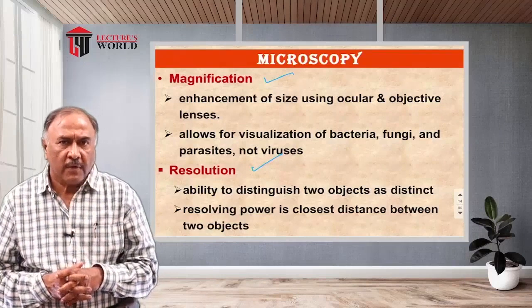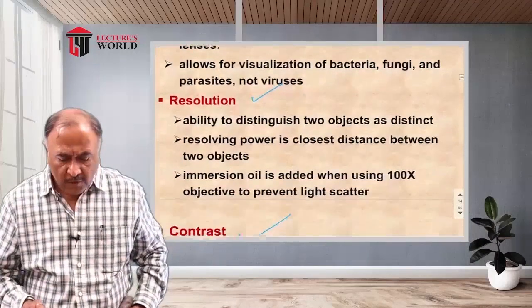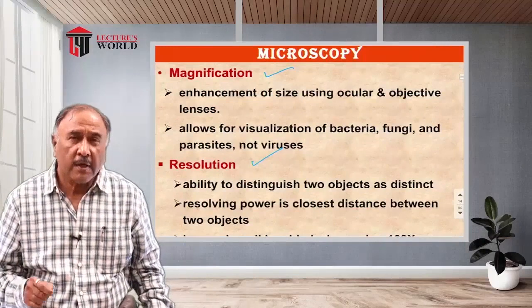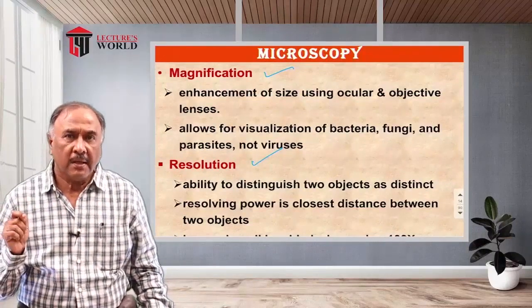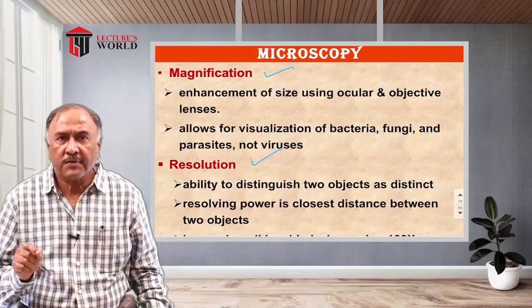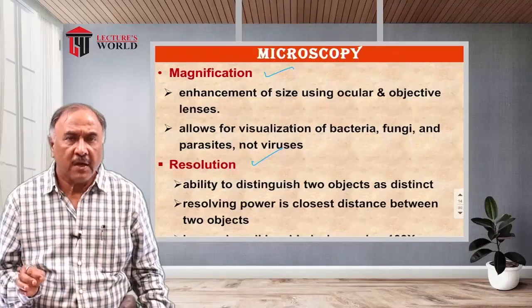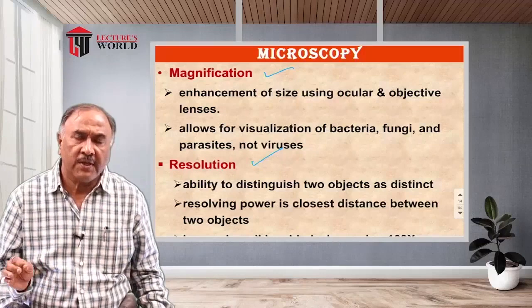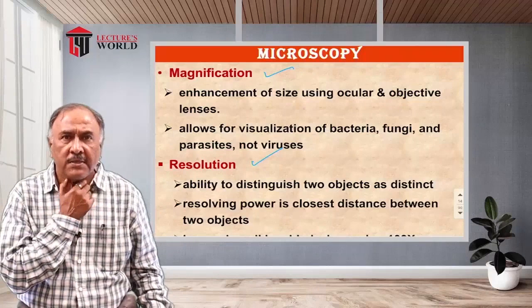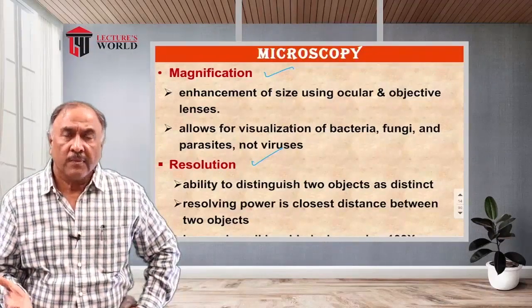So let us start first with microscopic identification. Microscopic identification basically leads to primary knowledge of which kinds of organisms are present in the sample. Be careful that we have still not separated or isolated the organisms; what we are observing here is the microscopic observation of the specimen.